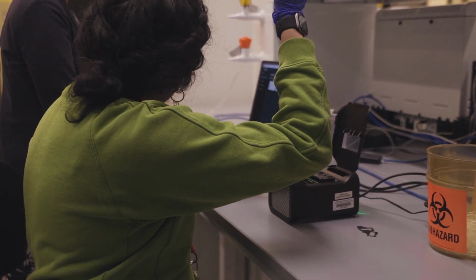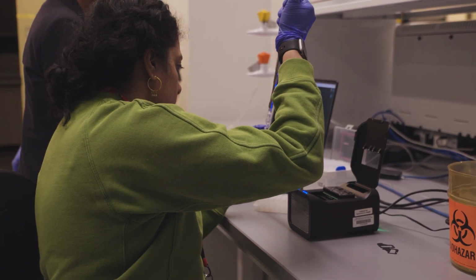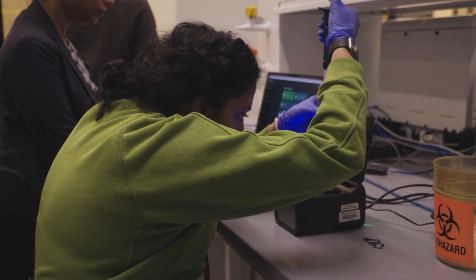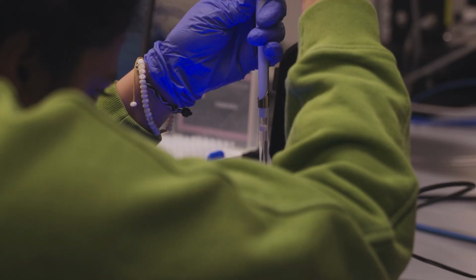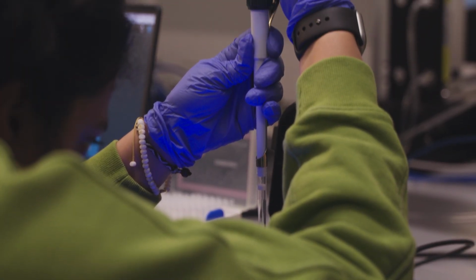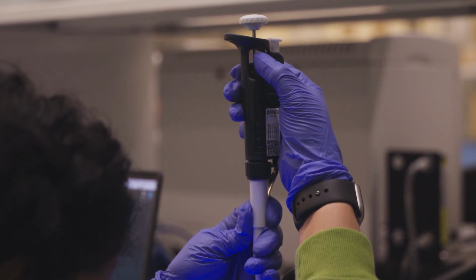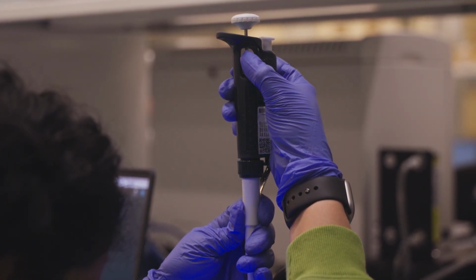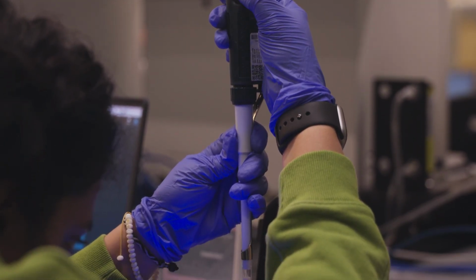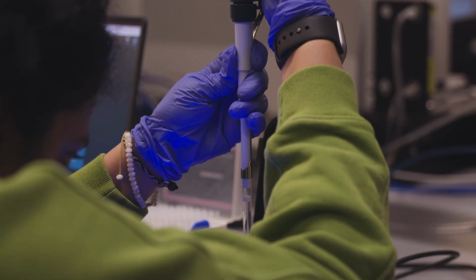When you set it to 500 and then go down, right? Or 200 go down? No, it's not 200, it's 500. Then do you do it completely? No, don't do it completely. You just leave a few microliters there, because if you do it completely, there would be air bubbles. There is a chance that you are introducing that. So just when a few microliters are left, you can remove it.